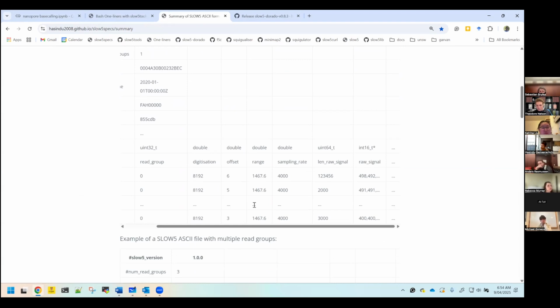So what happens is when the DNA strand passes through the pore, the sensor measures a value. But the analog to digital converter converts it into a digital value. If it was like 10 picoamperes, it will be mapped to a certain integer.